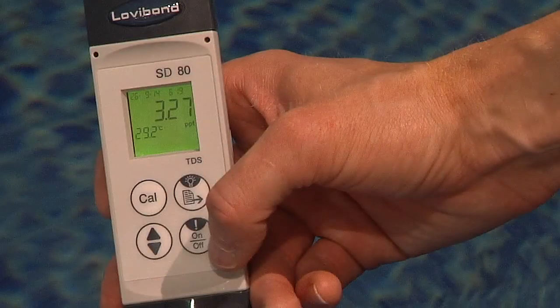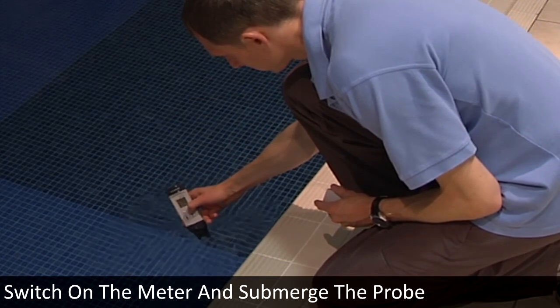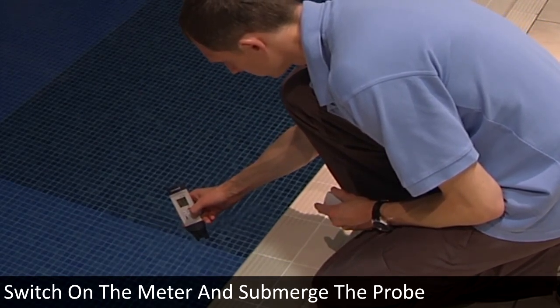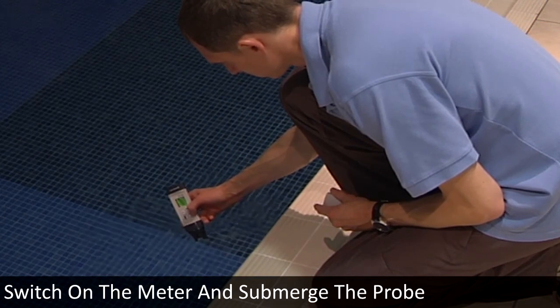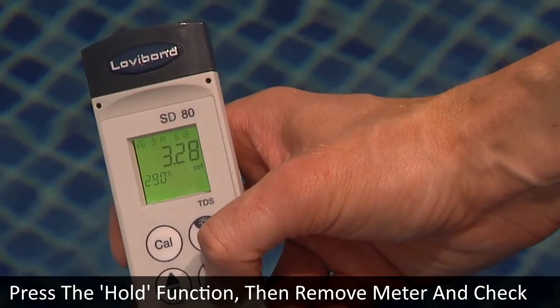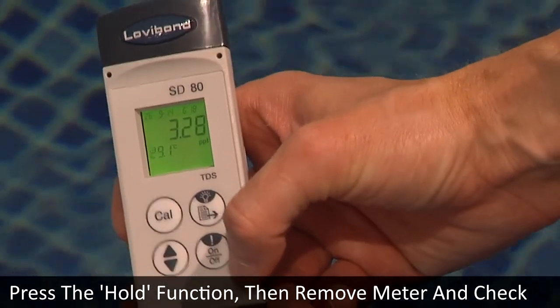These meters give direct on-screen readings and can be used either in the pool or by using a suitable sample container. Switch on the meter, submerge the probe for several seconds, then press the hold function. Remove the meter, check the readings, and record the results on a log sheet.